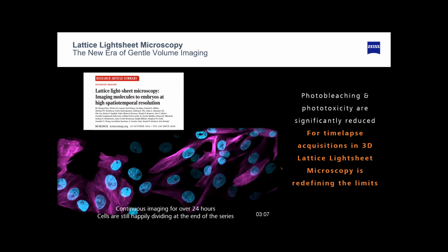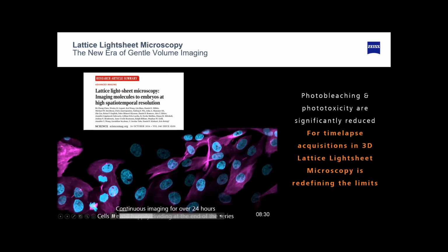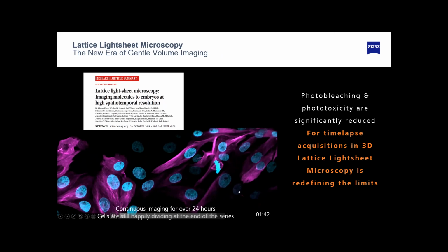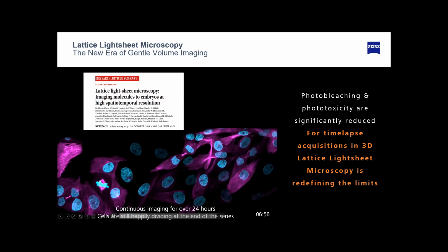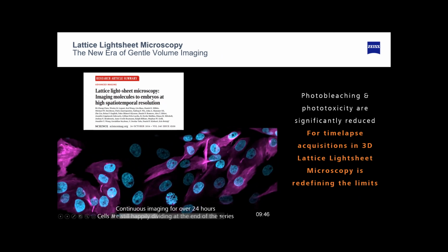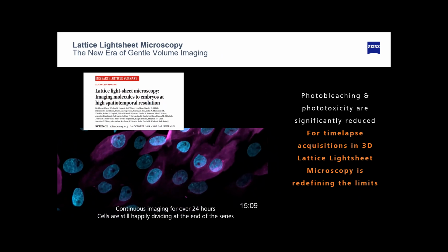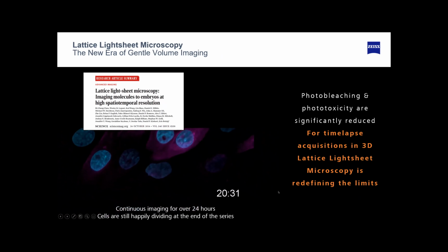It shows you another example here. You see dividing cells over multiple hours, and you can see a cell that divided at the very beginning. I should go back. I think it's the first cell down here, which splits up into two cells. And this is 4 hours, 5 hours, 6 hours, 7 hours in. And you will actually see the same cell that already divided here, redividing again after 18 hours.